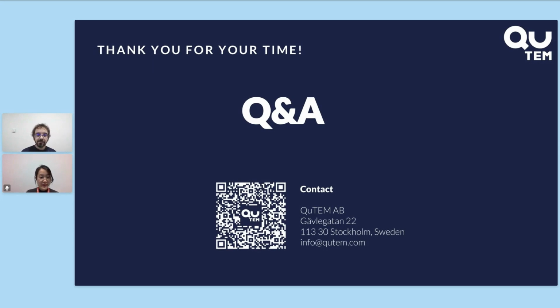Okay, and I think we have time for one more question. So is the quantification of viral particles, for example, intact, broken, packaged, or empty particles, performed manually or is it done by our software? Yeah, so that's a good question. Whether it's done manually or directly by the software depends a bit on the particle type.